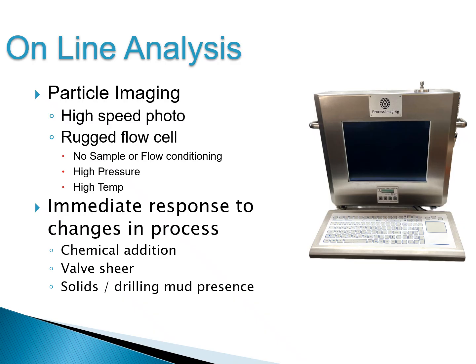Same thing with the solids. They can tell the concentration and the distribution of those solids. If there's two different types of solids, they can also tell the difference in two different types of solids in many cases. So these are able to produce all the data that an operator might need without the operator having to do any sample manipulation or have any sophisticated chemistry available. Water passes through it, the data is generated, water goes into discharge.